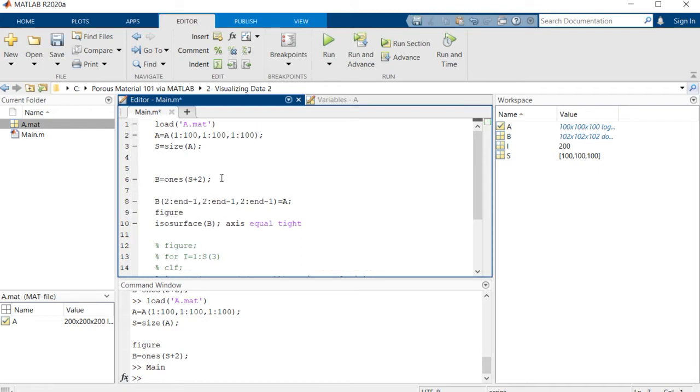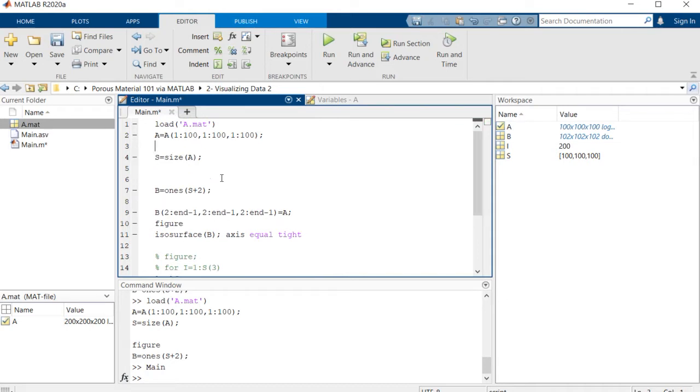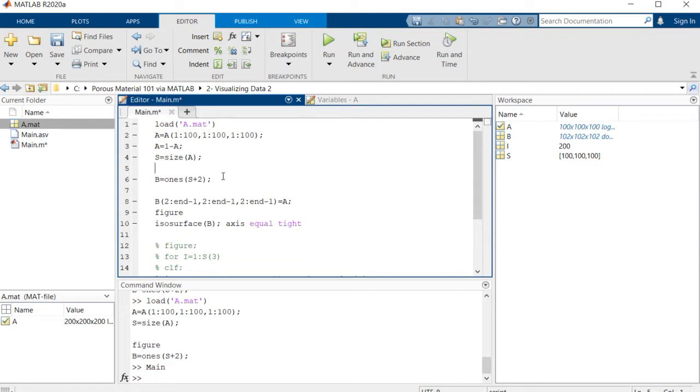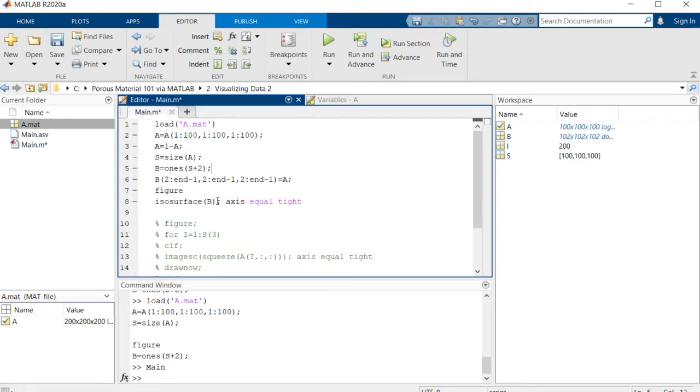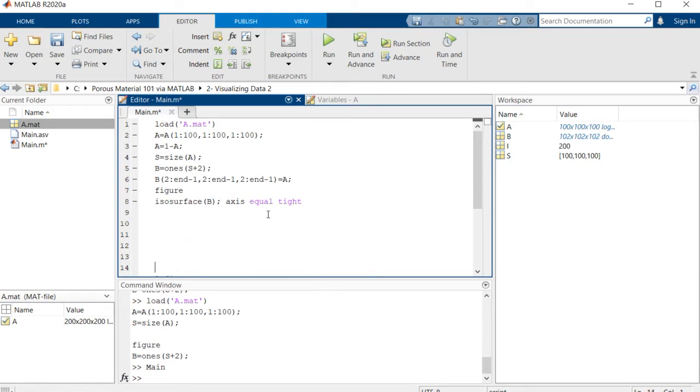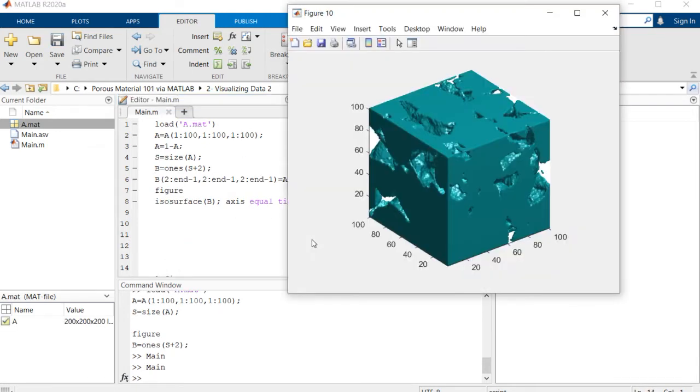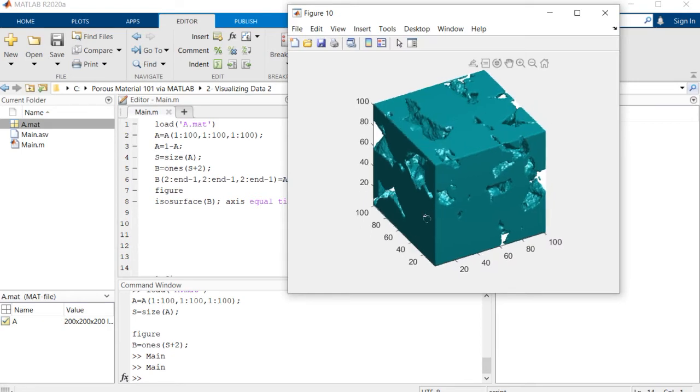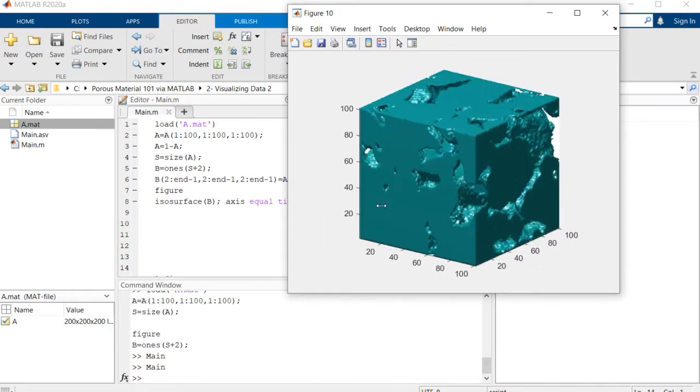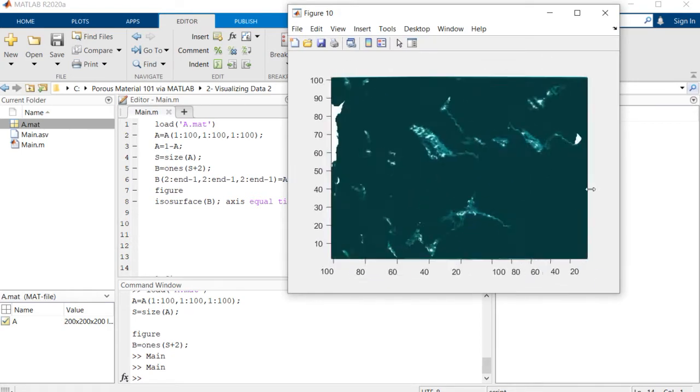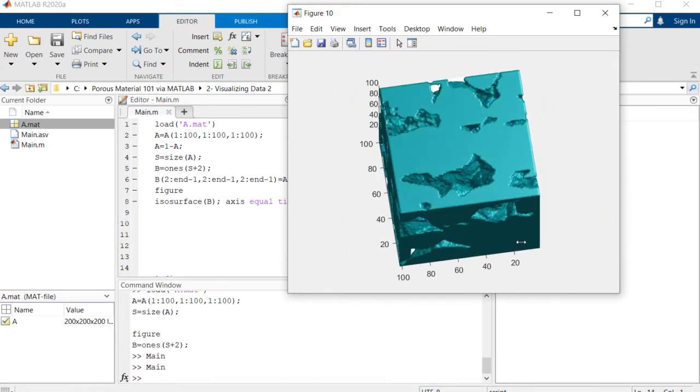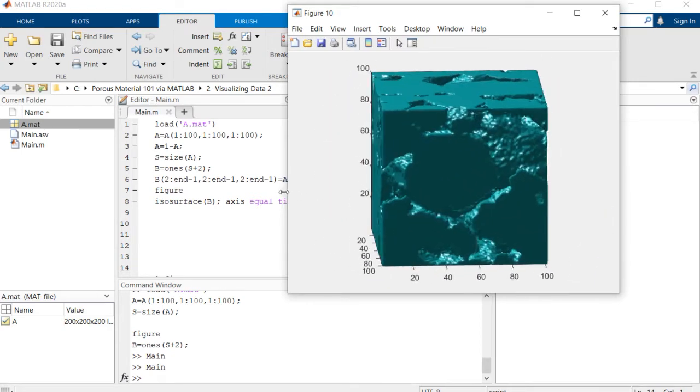So simply if we wanted to visualize the solid space, we can easily do this. a is equal to 1 minus a. Let me get rid of these empty lines to make the code more clear for you. So if we run this, we have this nice image of solid space of the porous material.